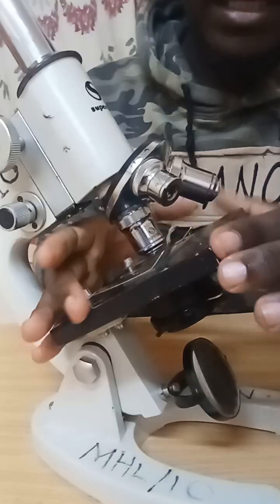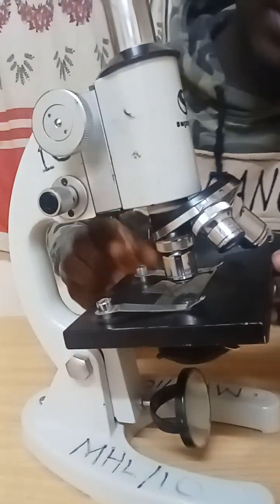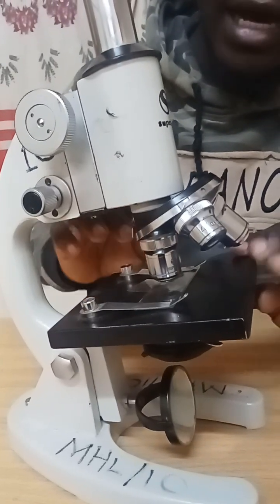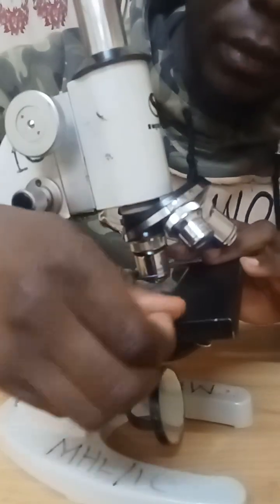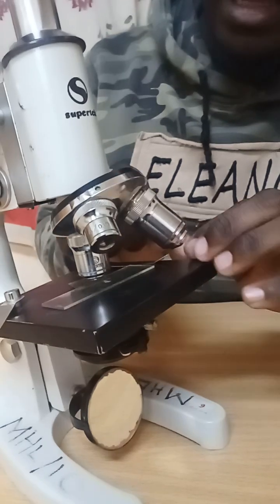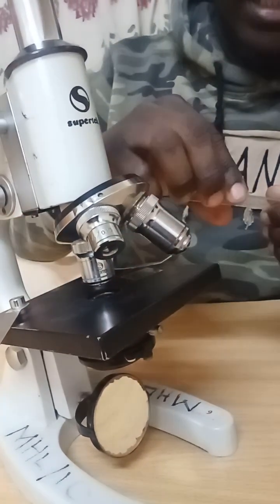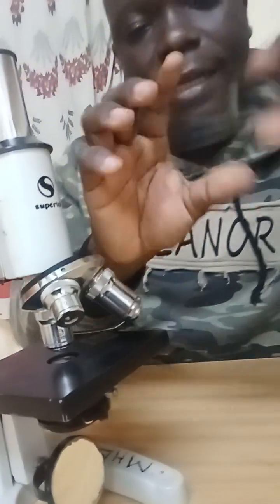Then this black structure you're seeing, it is the stage, and the stage is where the specimen is placed. And this stage has what we call clips. As you can see, we have a clip here, then another clip here, which hold the specimen. And the specimen is not just kept on the stage. It is placed on what we call a slide.